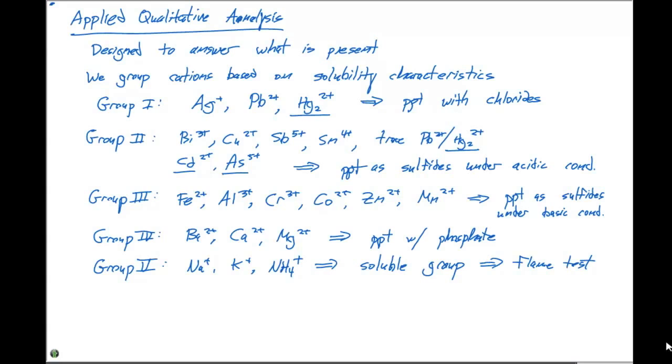As we go through this scheme, there's one theme that I really want to touch upon. And that is we're going to be doing 2 particular tactics here to separate these ions and identify them. The first thing that we're going to do is isolate.